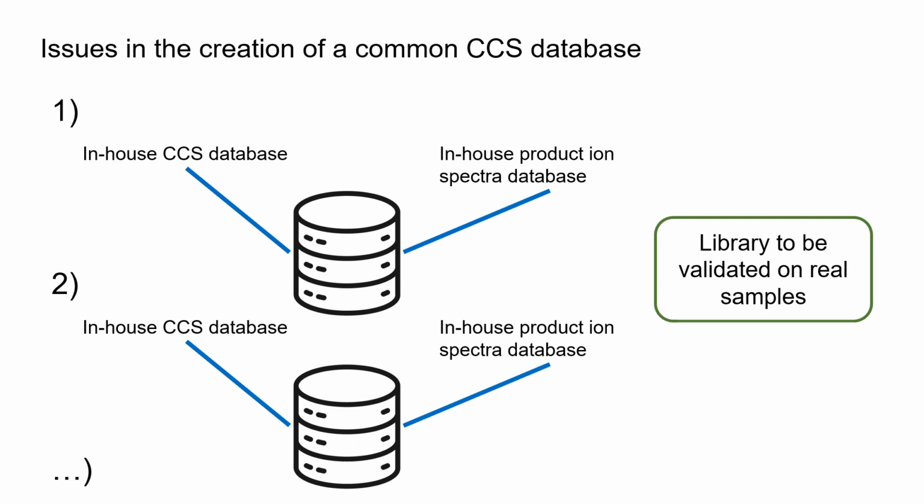Yet, we use product ion transitions in MRM methods and accurate mass of product ions in high-resolution mass spectrometry, and they are implemented in the regulation criteria, even if they can vary from lab to lab and of course between different technologies just as much as the CCS do.